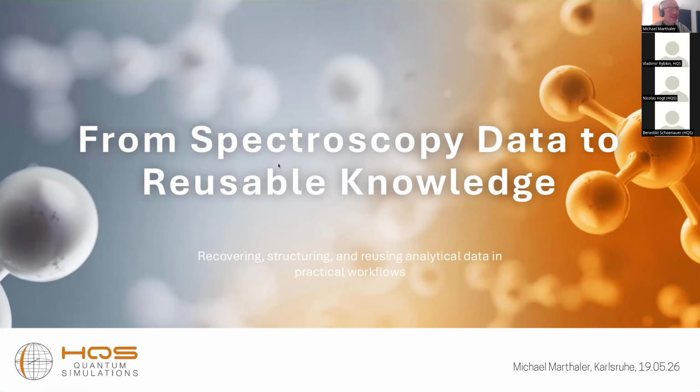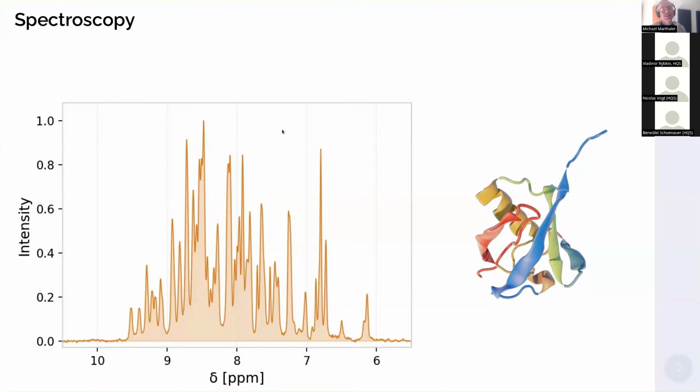So this webinar is about spectroscopy. Okay, just since I know from seeing the attendees, it's a diverse crowd of people. Let me remind you, we are talking about spectroscopy, where you use some type of microwave, radio frequency, or light to investigate properties of molecules or materials. And what you normally then see is a spectrum like this, where a lot of stuff happens, as you can see. I mean, all these peaks have some type of information. It can be even more than that.